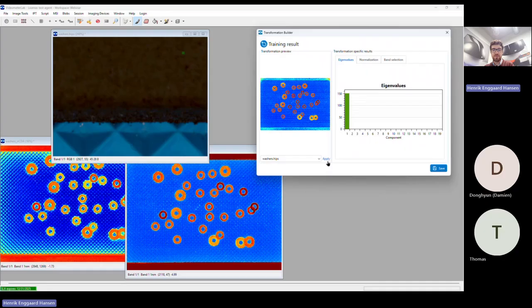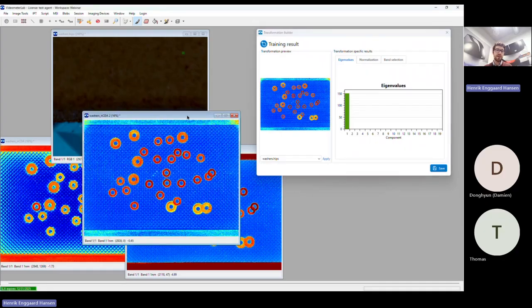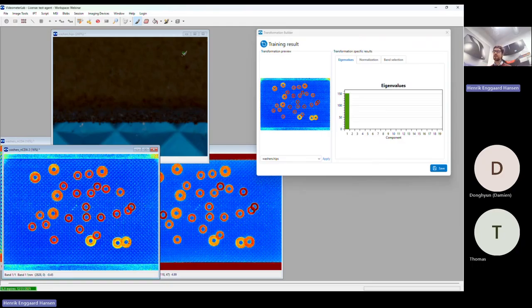Right, and we would imagine that that would not make a big difference. This is just 5 more points. But the important thing is that these 5 points add so much information because of what they do to the variance of the data. They really show that the background data set is spread out across this blue and black parts, really, really spread out. And suddenly we can see that we actually also get the blue background in. We see some more confusion in the corner, and we could work on that.